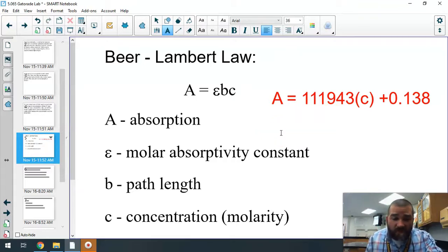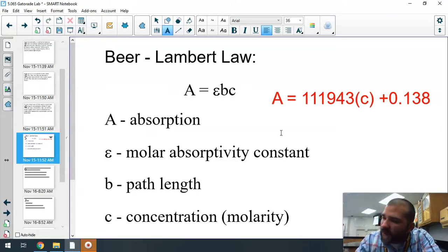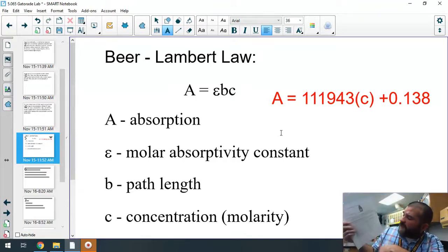What I would like for you to do is turn in this sheet with everything filled in. I have another column here at the tail end, which is absorbance over M2. So you'd take the 5th column divided by the 4th column, okay? This is like a little snapshot of your molar absorptivity. In theory, that very last column should be constant. Spoiler alert, it's not going to be constant. But anyway, do that calculation if you could. Fill in all your molarities if you could.